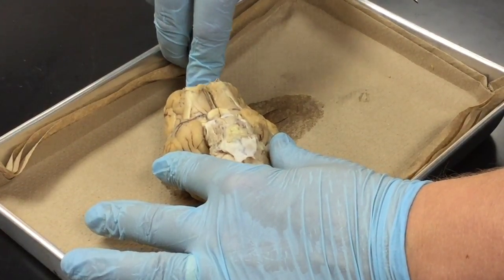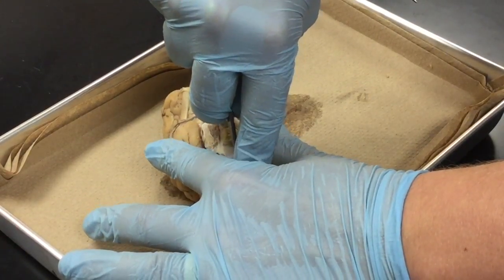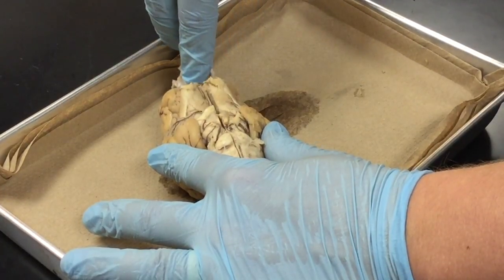Just like so. So once again, find where that incision was and go ahead and make it a little bit larger.